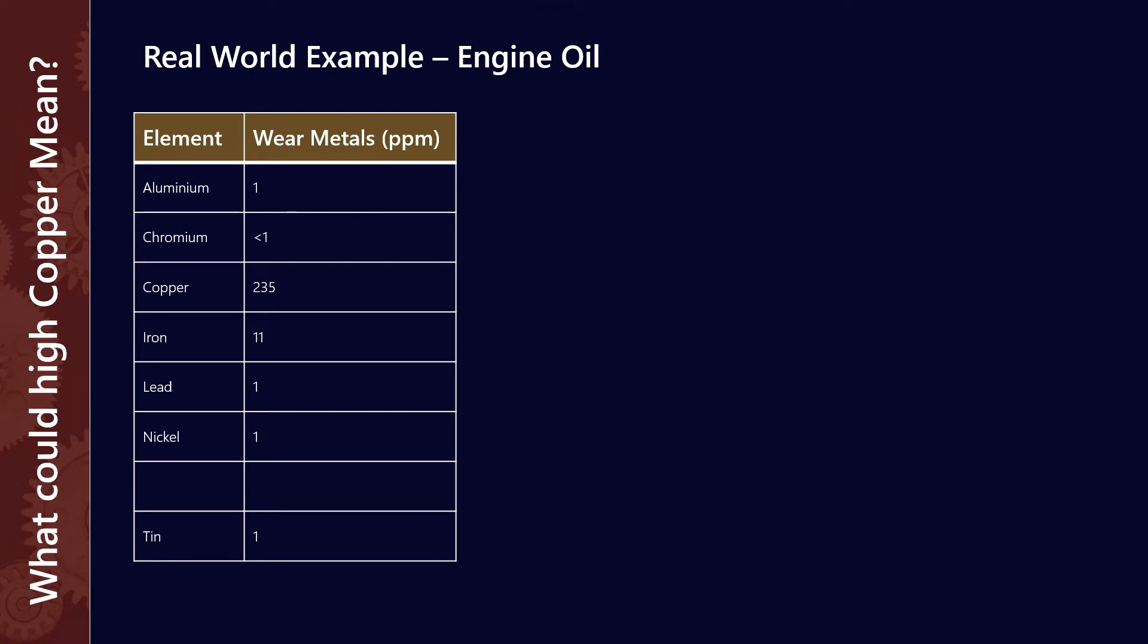Let's take a real world example of an engine oil. We're going to look at just a single sample but look at how we need to use some of the other results to give us more context and some different scenarios about how we might use those results to get some more insights for our application. So one thing you'll notice here is I'm just showing the ICP elements and you'll see copper looks a little bit high.